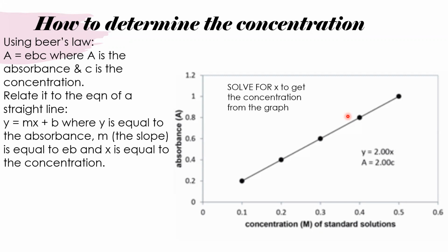The calibration curve is generated by preparing a series of solutions, usually 3 to 5, with known concentrations of the species being measured. Okay, that's important. The concentrations are known. And then every standard curve is generated using a blank. The blank is just some solution that is assumed to have an absorbance value of 0 or close to 0, and it is used to zero the spectrophotometer before measuring the absorbance of the standard and unknown solutions.